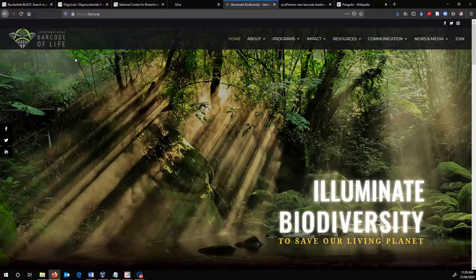But unfortunately, the whole project was set up before DNA metabarcoding. It was set up for DNA barcoding. And the region that they use, the cytochrome oxidase 1 region, is variable all the way through it because it's a protein coding gene. I'll explain the reasons for that in a moment, why that's important. Well, I have explained it before in lectures, so I won't go into it too much.